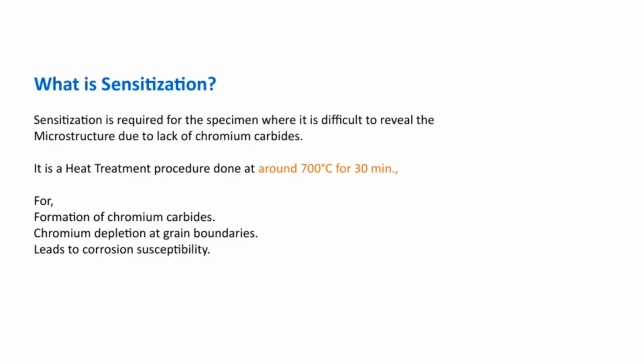So, in essence, sensitization is a controlled heat process aimed at understanding or managing the microstructure. But it also highlights the delicate balance between beneficial carbide formation and potential corrosion vulnerabilities.